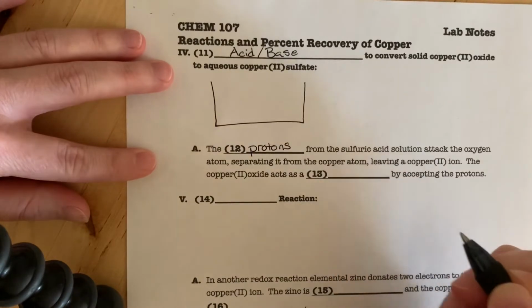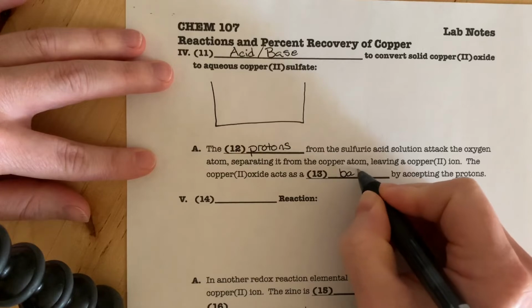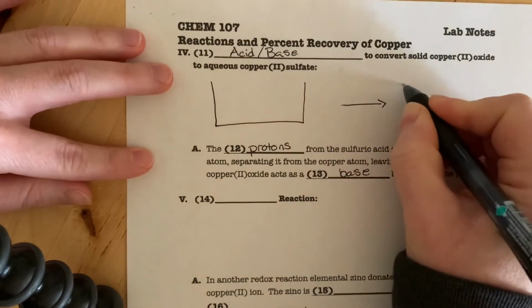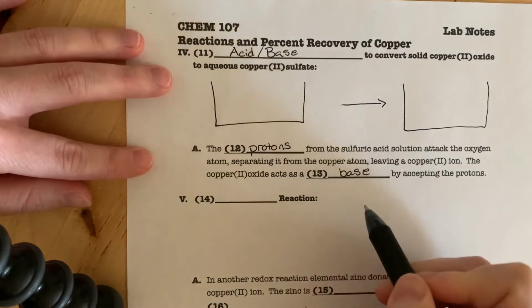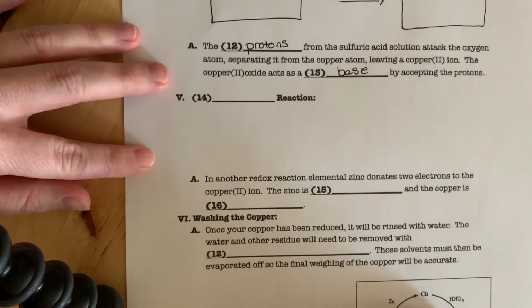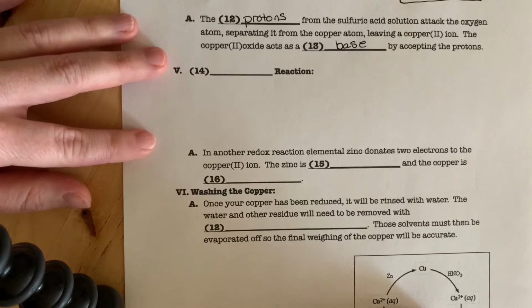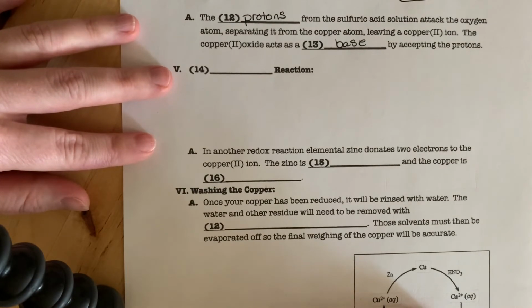It's the oxygen on the copper 2 oxide that's acting as a base. So here I invite you to draw your principal species in solution. Anytime you get stuck on a question in this lab, look back to your principal species in solution, and your answer probably lies there.